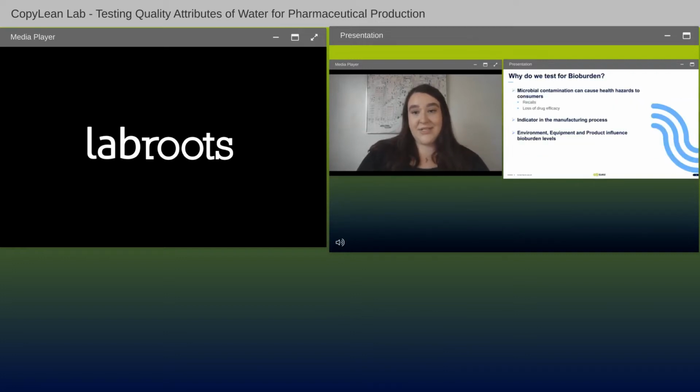So the question is, why do we care about bioburden and why do we test for bioburden? So in January of 2012, the American Pharmaceutical Review published an article detailing recalls involving microbial contamination. Of the 103 cases presented, 34 of which were caused by Burkholderia cepacia.